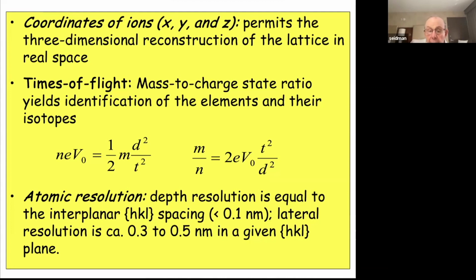And how do we get d? So we take a specimen like tungsten, and we know what the isotopes of tungsten are, and we know hence where they should be in a mass spectrum. And then also at the bottom end of the periodic table, we have hydrogen, and there's always a little bit of hydrogen in the system, and we know what its mass is. So we have two data points. Let's say tungsten 186 and hydrogen, and it turns out it's completely linear. So we can interpolate to get the masses of other species.